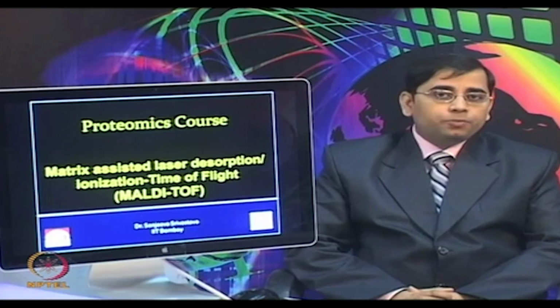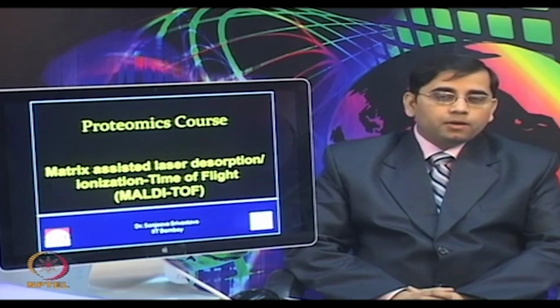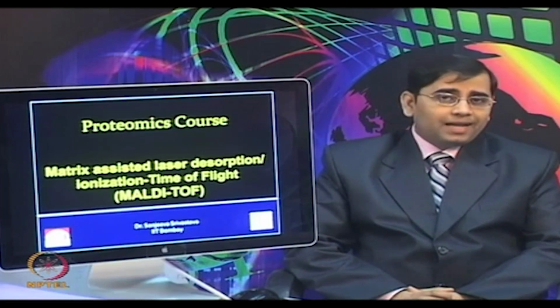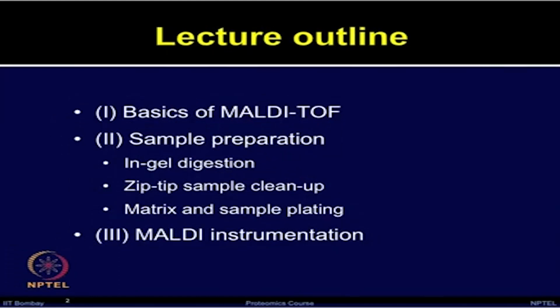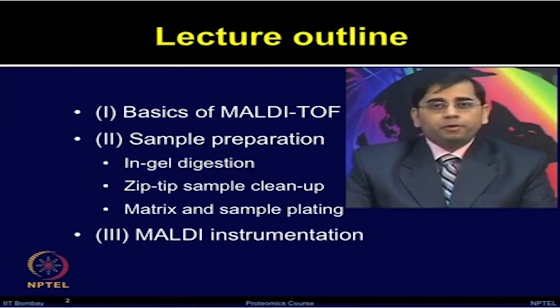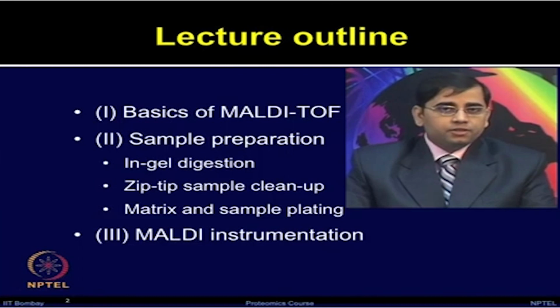This provides a high throughput platform for several applications, including molecular weight determination, protein identification, as well as post translational modification studies. So, in today's lecture, we will talk about the basics of MALDI-TOF, and how to prepare the sample for MALDI-TOF or TOF-TOF analysis, which will include in-gel digestion.